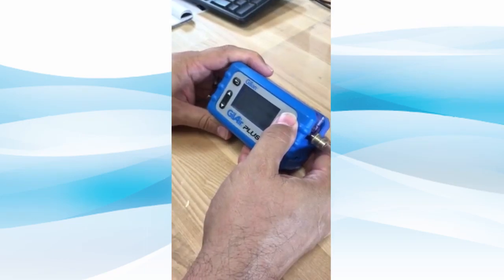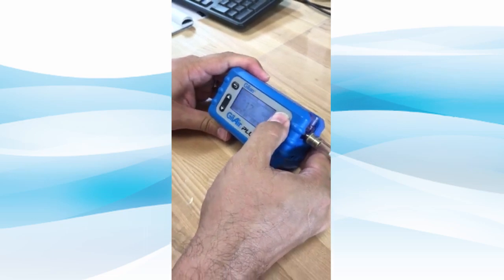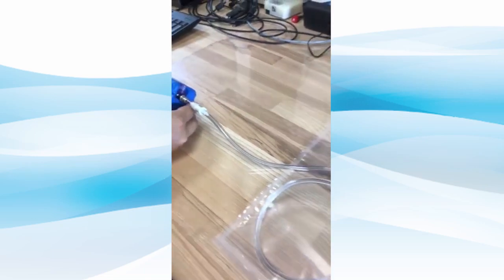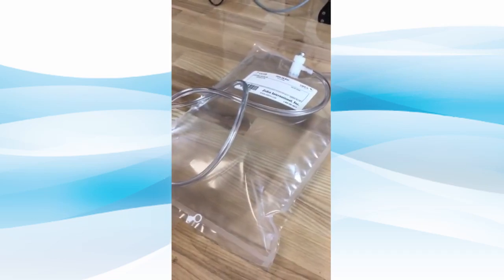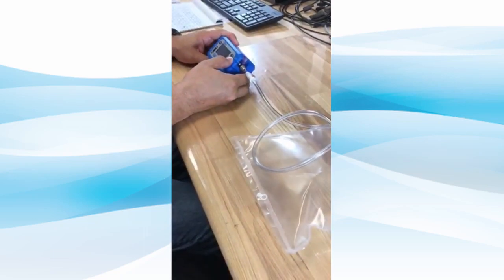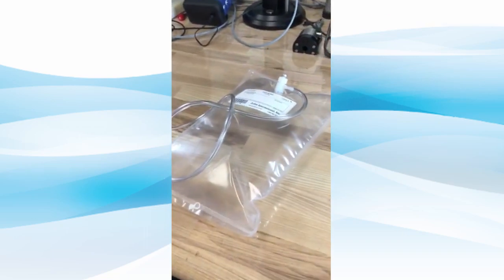To begin filling the bag, start the pump. The air drawn in from the inlet block will flow directly into the Tedlar bag. You may either stop the flow manually on the Gillair Plus pump, or the pump will shut off on its own once it detects that the bag is filled and the pressure exceeds the pump's fault limit.